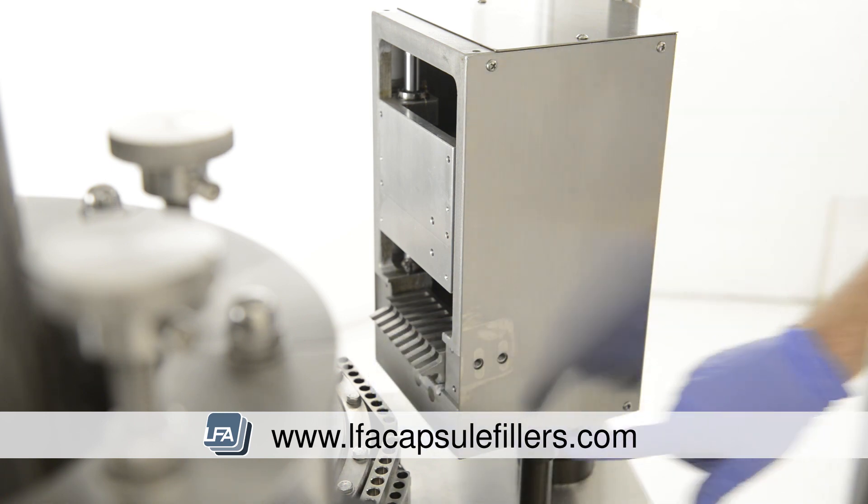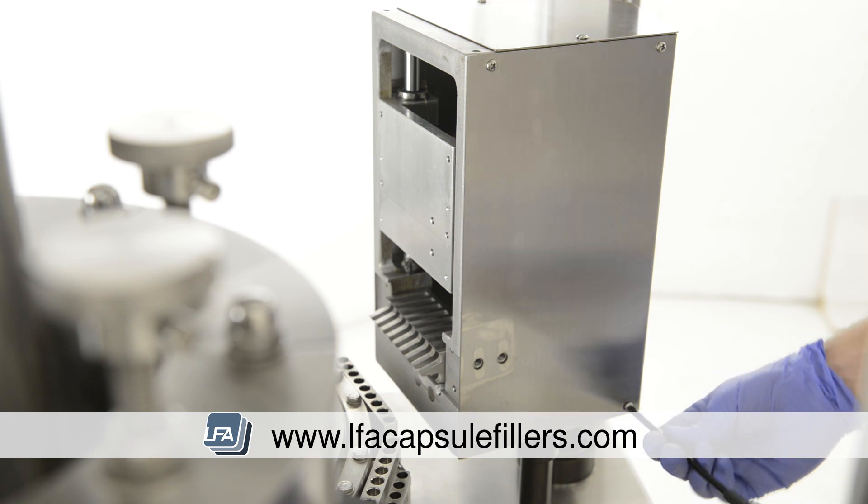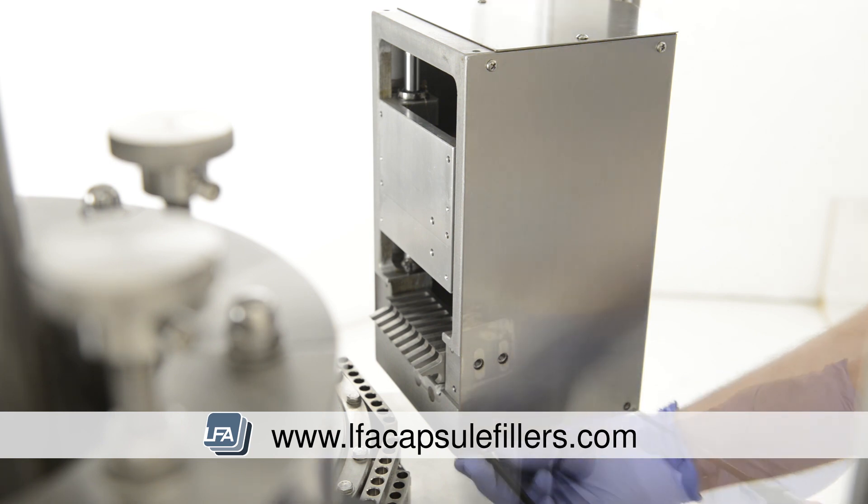Now we're going to remove the panels of the sewer to allow more access to the bolts inside. There are four screws on both sides of the unit — remove these and the panels will slide off in one piece.